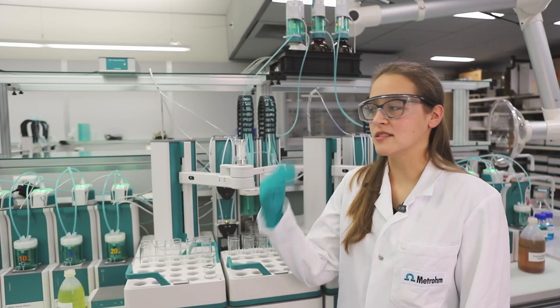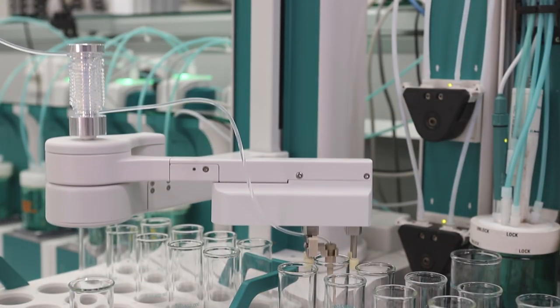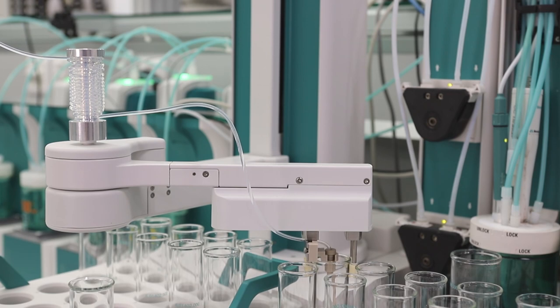One key feature of the system is this automated pipetting. Omnis checks for the beaker and aspirates the sample.